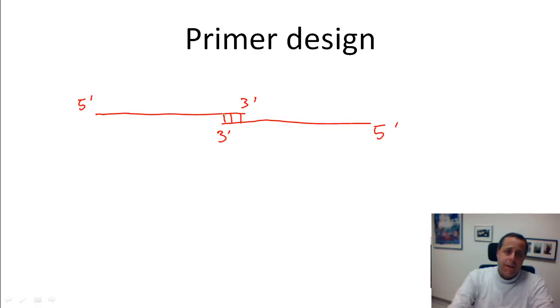What happens is that these ends, these three prime ends of your primers, will find each other because they are complementary. Maybe you have been designing this to be a G and this to be a C, maybe this is now an A, this is a T, and perhaps this is another G and this is another C.